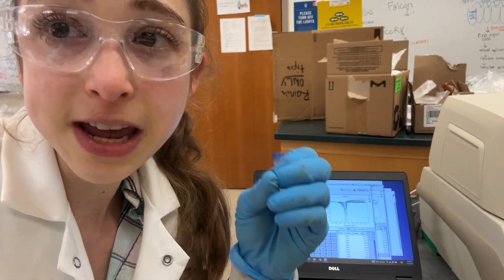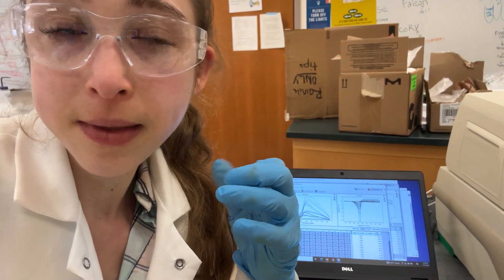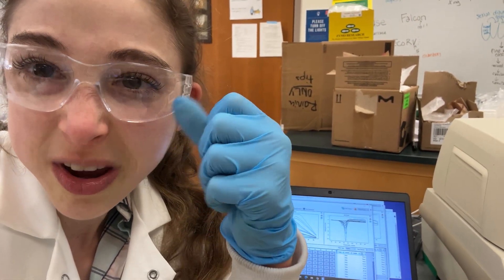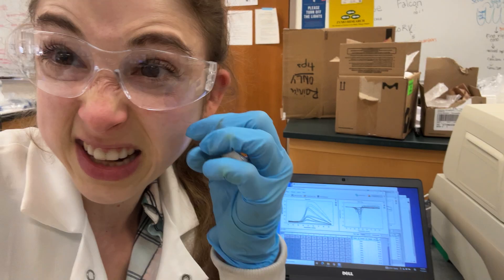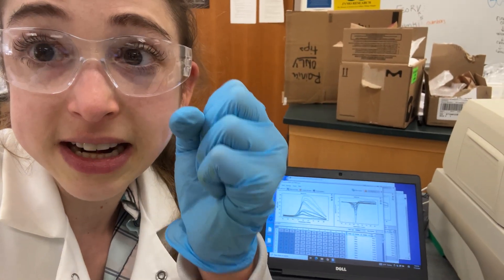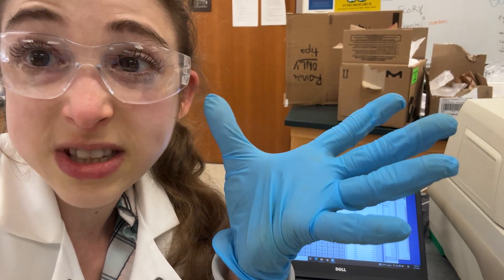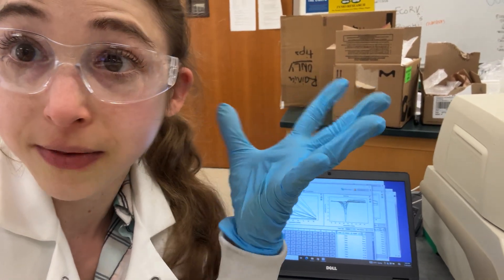What you can do is take a protein and start heating it up. The protein is going to initially, if it's really sturdy, wiggle but stay stuck together. Eventually, however, the protein is going to unfold, and then all that dye is going to bind, and you'll see fluorescence.